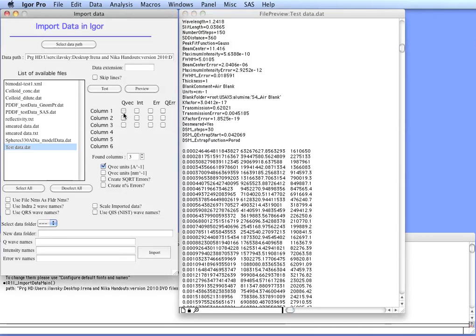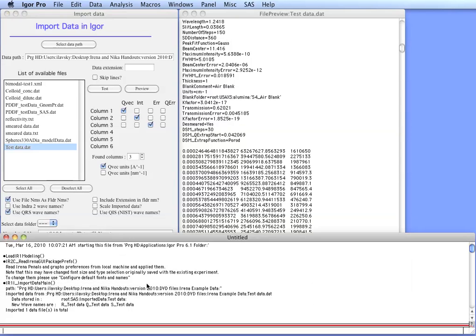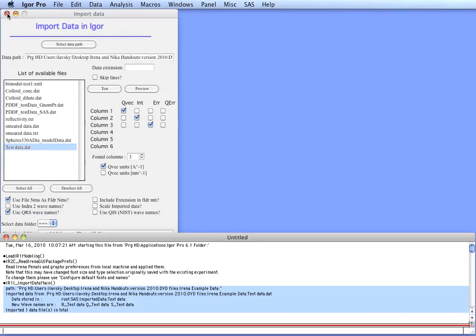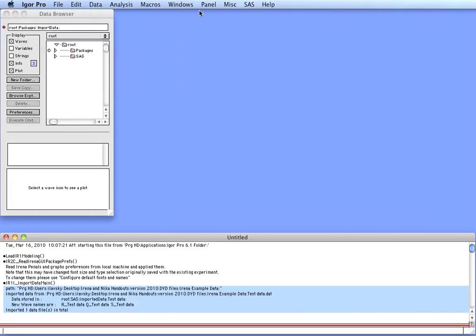So the first column is Q, second is Intensity, and third is Error. Let's use these two checkboxes so the file is named easily for us to understand. If you hit enter import here, you now have a record down here which tells you what has happened. It has imported one data file and created new waves which we can now use. So now we have the data inside an Igor experiment.